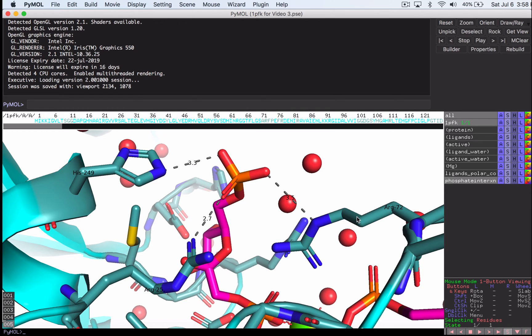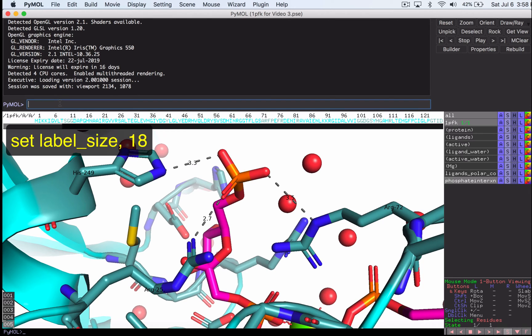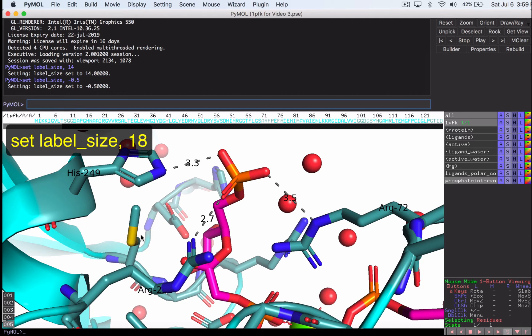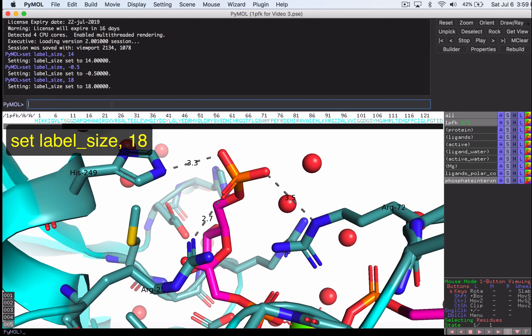Now that everything is labeled, these labels are pretty small. Let's fix the label size. The command to do this is set label_size and then comma. Now we have some choices. We can either do this in font sizes that we're familiar with, so like 14 point font. But if we set the label size with a negative number, we're doing it in angstroms. So whatever you're comfortable with, and you'll see this makes it quite a lot bigger. I think it was just about at 14 before. So let's just try it with a positive number, maybe like 18, see if that works. That's a little bit smaller. I kind of like that size, so that looks good to me now.